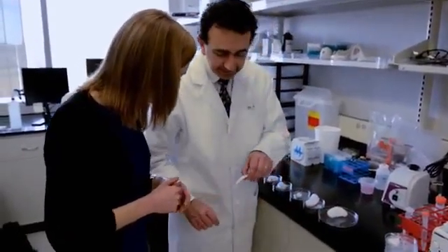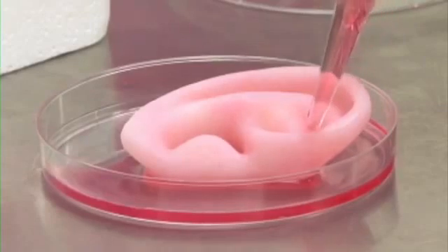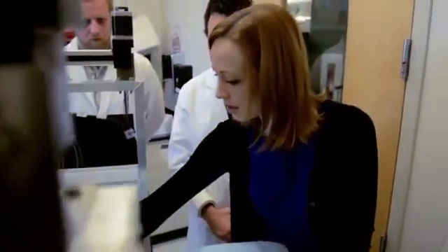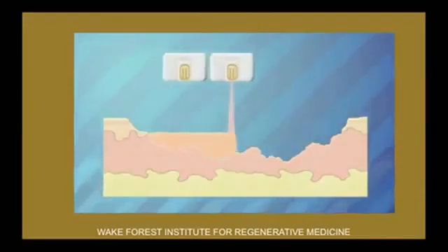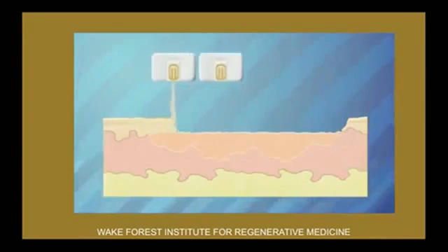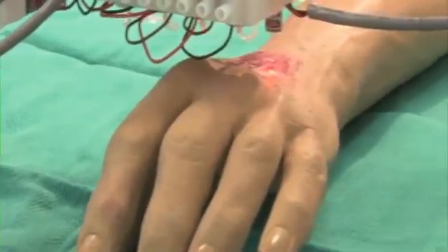Right now, Dr. Atala's bioprinting is in the preclinical phase. Simpler organs will be the first to reach patients, starting with skin. If this were in fact a wound, it would be dropping real skin cells over the wounded area. The skin printing project is being funded by the U.S. military with the hope of treating injured soldiers in as little as 5 years. But while Dr. Atala's work is cutting edge, 3D printing isn't new.